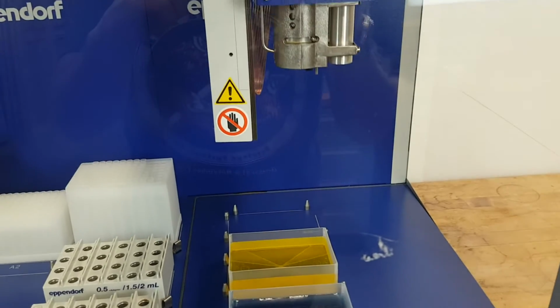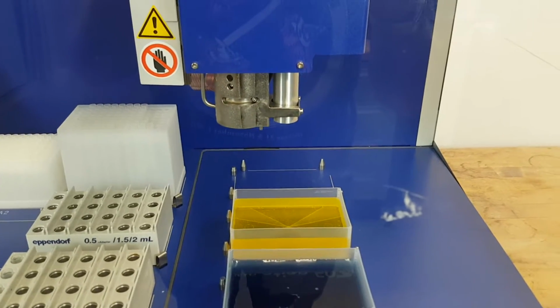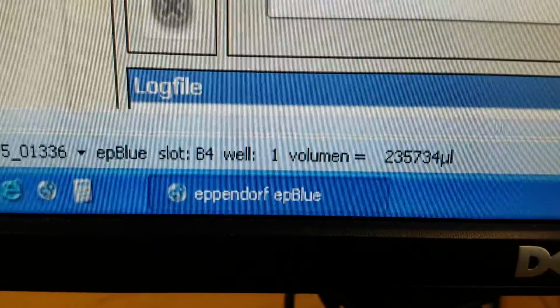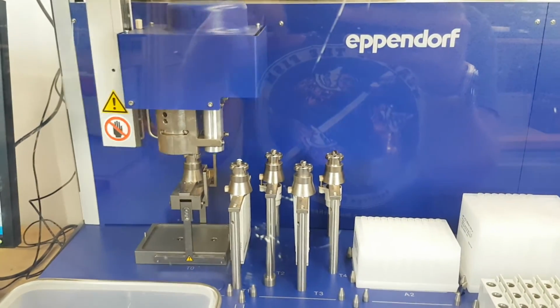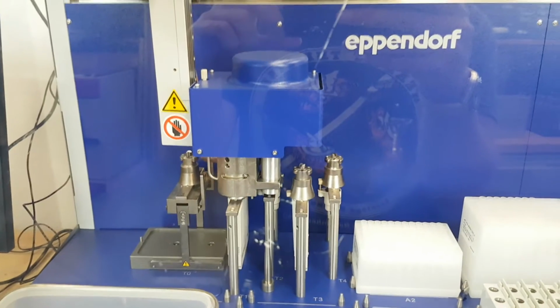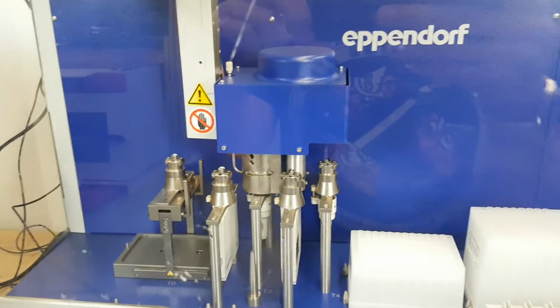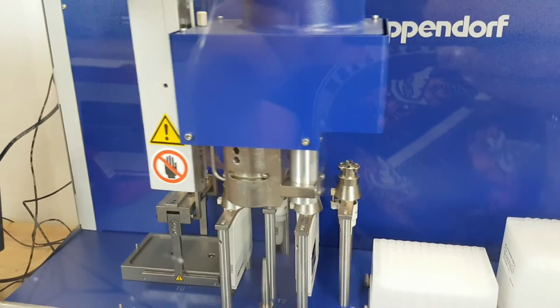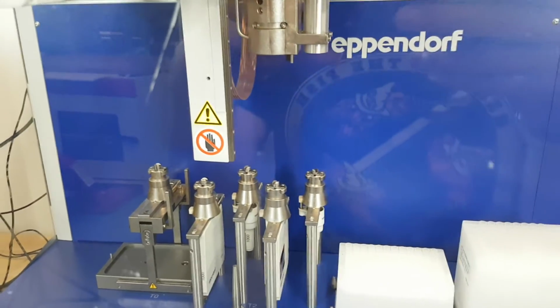Okay, so now it's gonna check the level of liquid here in this bin, and I can show you here on the screen. Position B4, volume is 235 milliliters, and now it's going to identify each of the tools that it has access to. It'll keep checking until it finds all the tools that are needed for this run. The third tool is the last one that it will need, so it will not check the fourth tool. It's a smart feature that saves some time.